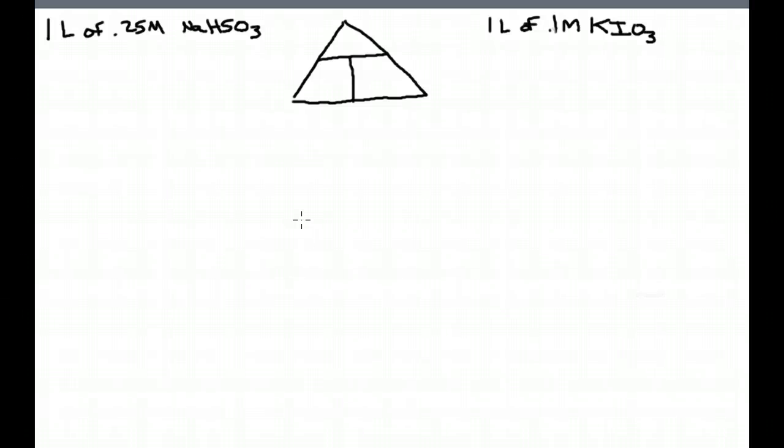Alright, in this third video of Molarity, I'm going to again show you how to make a solution. I got two different examples here, but as a review, remember Molarity. Molarity. As you can see here, the word moles are in there, and that's there for a reason.